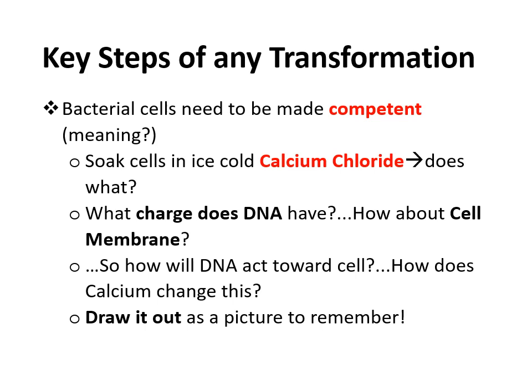And as you're going to see when I draw this out on the next slide, the negative DNA is now drawn to, or attracted to, the positively charged cell. And again, it's not that the cell itself is positively charged, it's that it's currently coated with the positive calcium ions, which serve as what we call an ionic bridge.